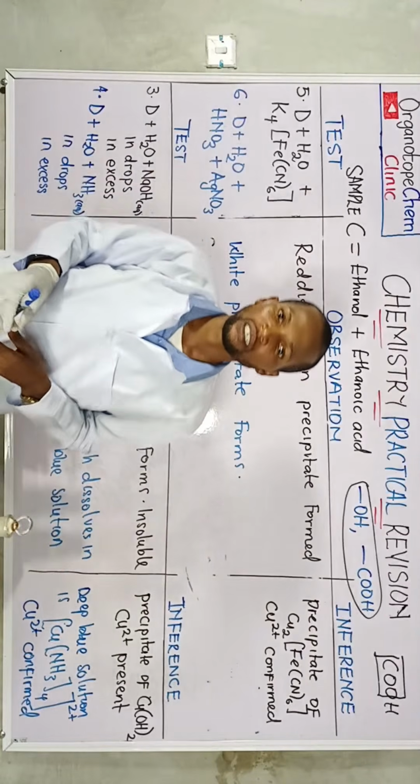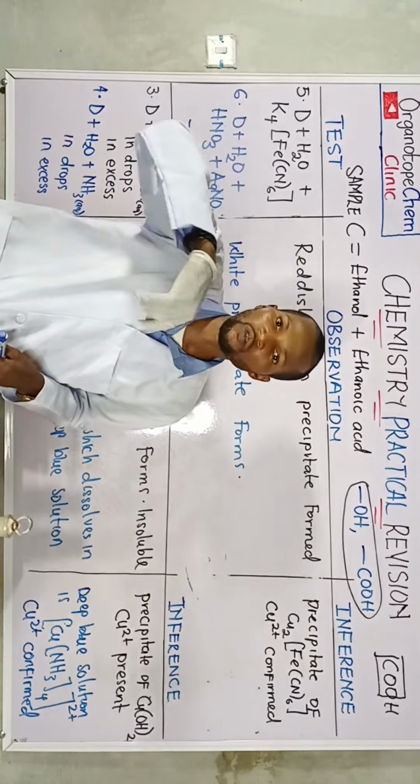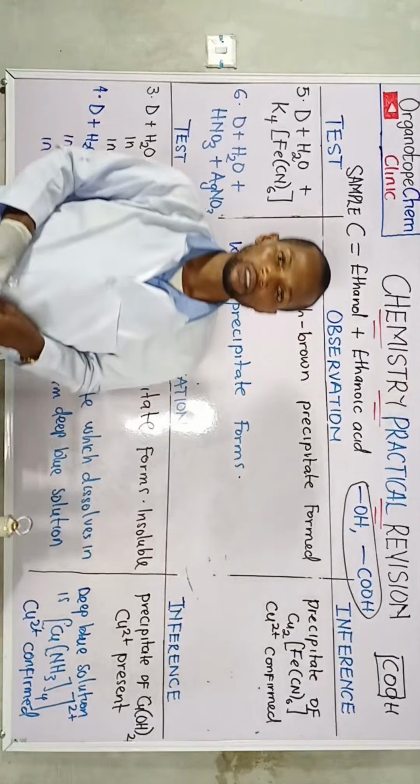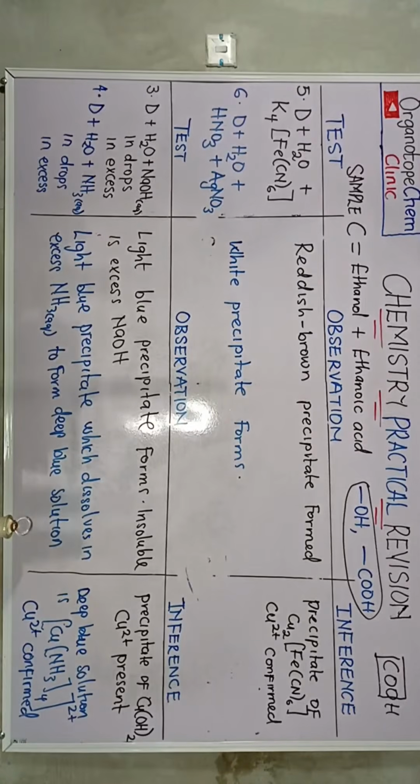So when NO3 is substituted by Cl, okay, what compound is formed? Type that in the chat. So when NO3 is substituted by a chloride ion in silver, what compound is formed? To confirm you are hearing me, type that in the chat. It is the compound formed that gave that white precipitate.